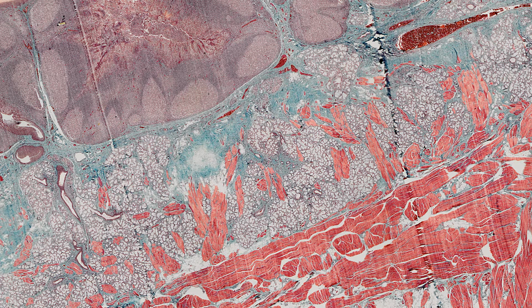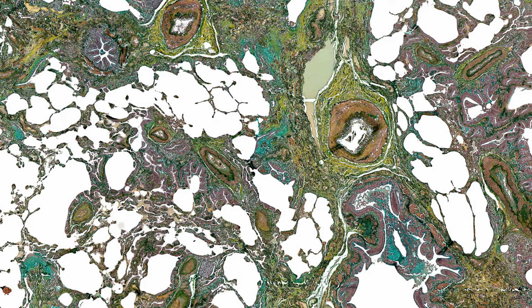The second problem is that these chromatic stains, and even the most complicated ones, are all rather crude. They will let you see tissue structure and distinguish cells from matrix, but little else. You can't, for example, see where a particular protein occurs in the sample, or where particular organelles are in cells, or track dynamic processes in living tissue.